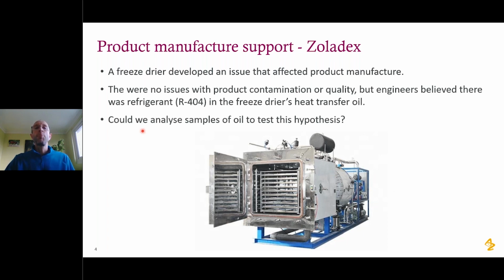The engineers hypothesized that they were getting leaking of the refrigerant of the freeze dryer into its circulating heated chiller oil, and they wanted to know if NMR would be able to help with testing that hypothesis and detecting what they needed to detect.